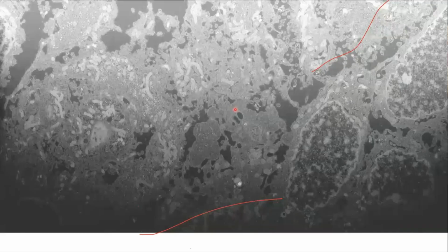We also have large area volume systems, and we can do all this by just changing the stage. You can generate a large area volume by spin milling single cells. We can generate this, and finally you can generate the tomogram.